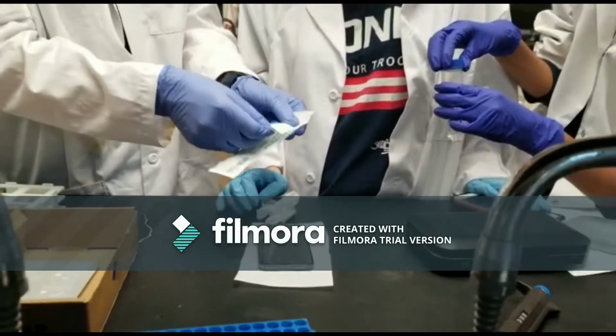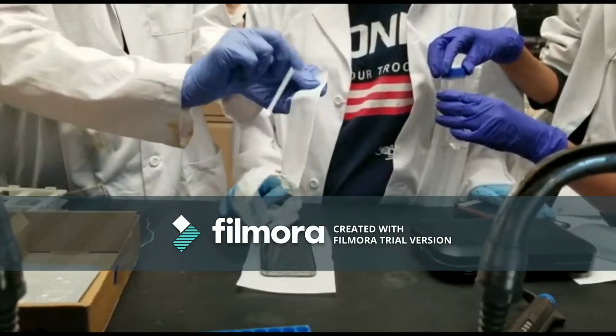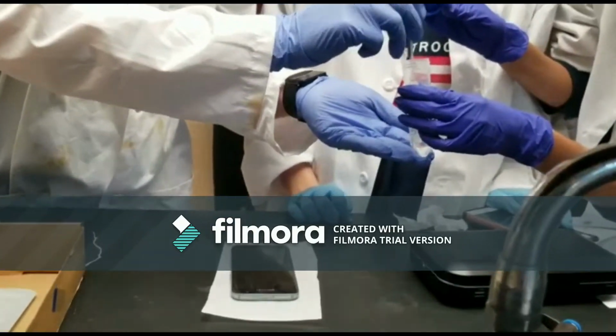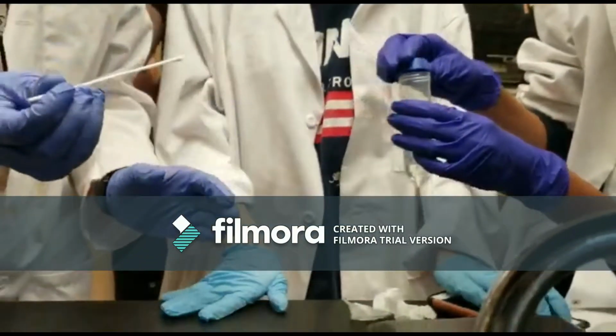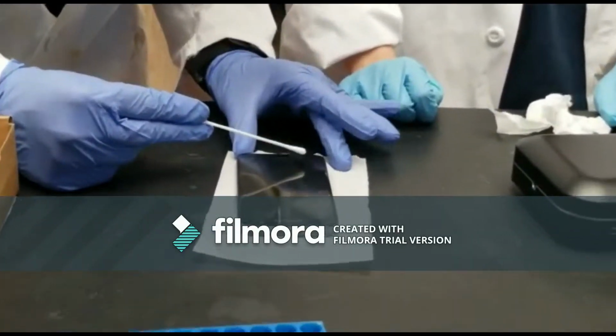Sterile gloves were used throughout the experiment. A sterile swab was dipped in sterile solution and was pushed against the inside of the container to remove excess solution from the tip. Half of the cell phone was swabbed.